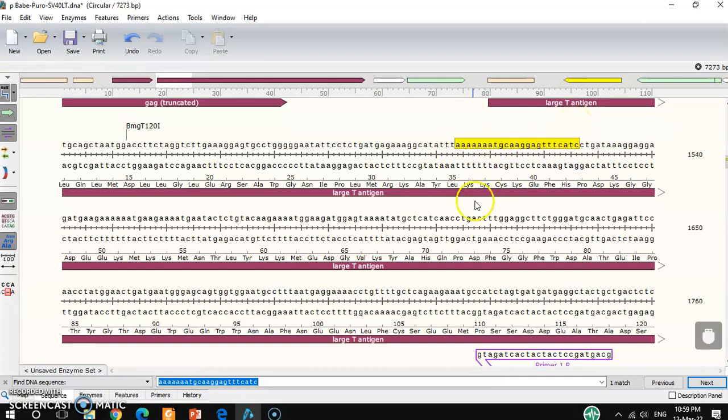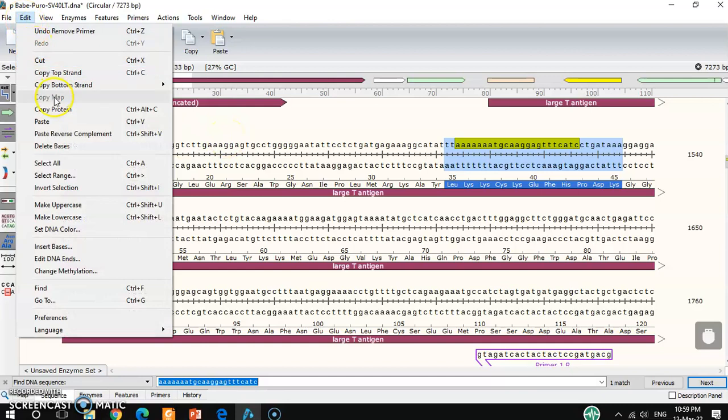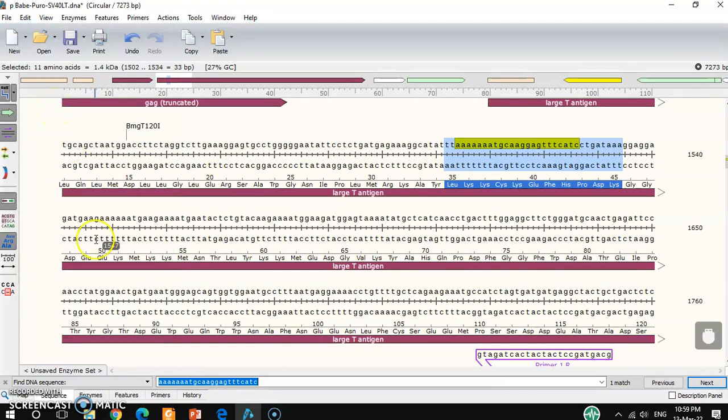If you want to copy the protein and check it here, that you can also do. From here, anywhere you can copy your protein sequence part, Copy Protein, and then you have to choose the Find Protein Sequence and paste here.